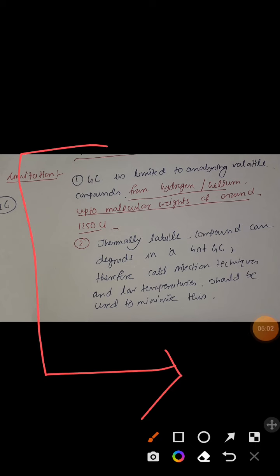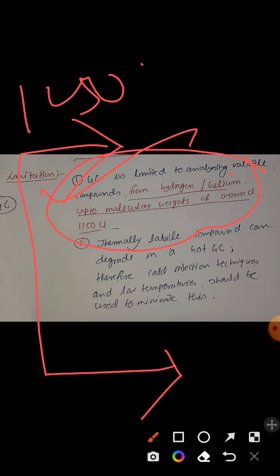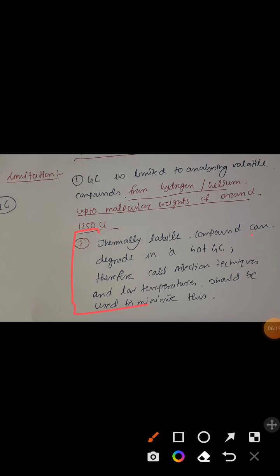Limitations. Now let's discuss the limitations. GC is limited to analyzing volatile compounds from hydrogen, helium up to a molecular weight of 1250 U. Thermally labile compounds can be degraded in a hot GC, that is, gas chromatography.